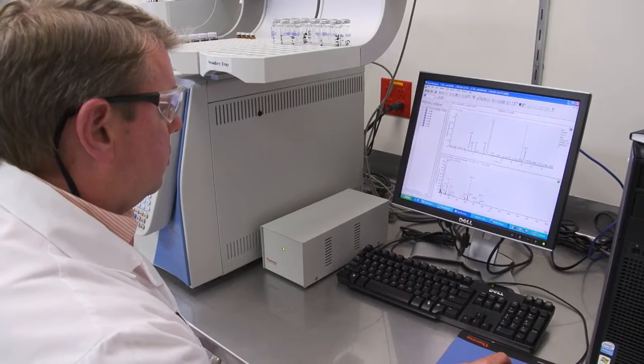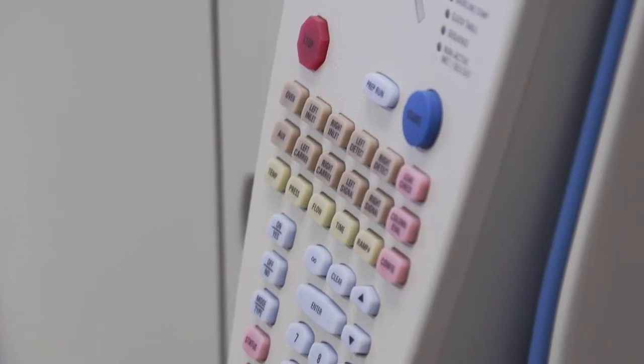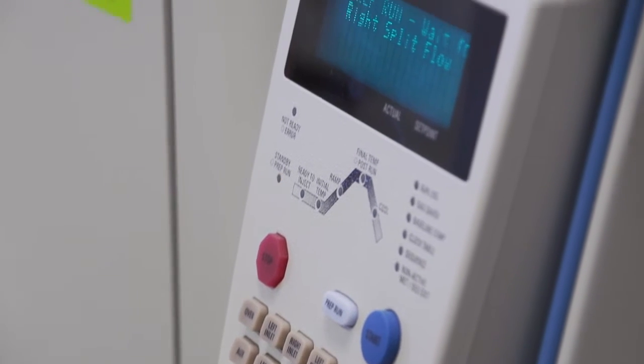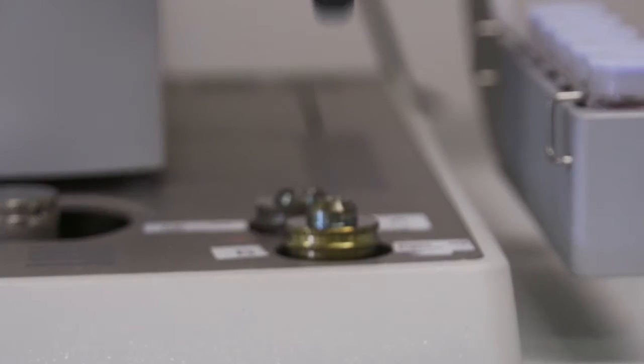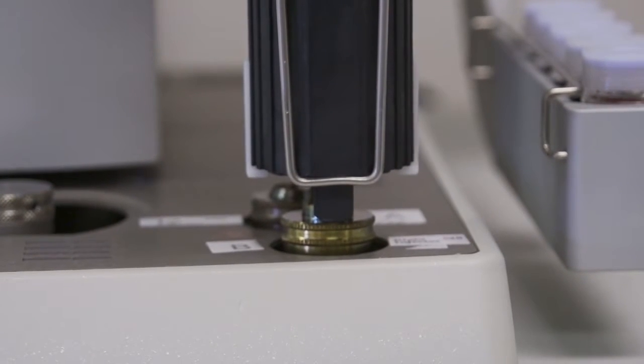Our comprehensive final quality control testing uses an array of technologies, including GC-MS, LC-MS, HP-LC, 400 MHz NMR, KF oven, and GC.